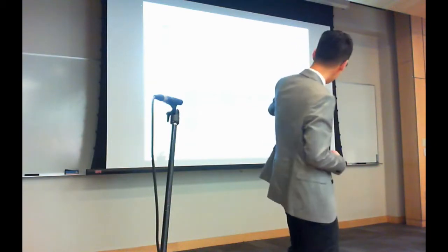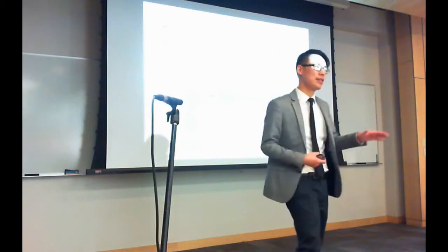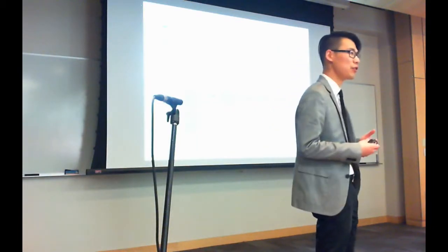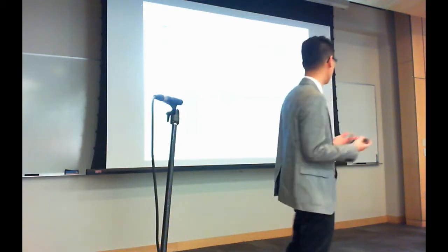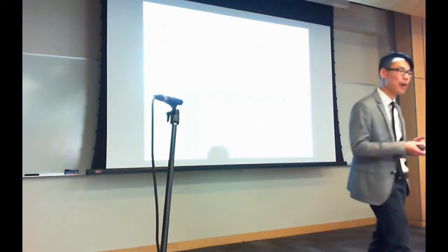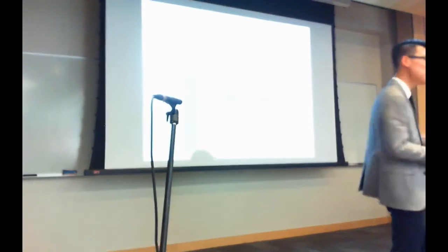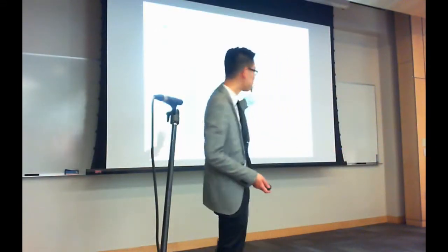And then another half, the error rates for the identifications are unknown or are too high. So those aren't useful to us either. So at the end, out of this 86 terabytes, we only have 3 terabytes of usable data and 15 million spectra that were identified. Let's fix this situation. This is about 5% of the data.